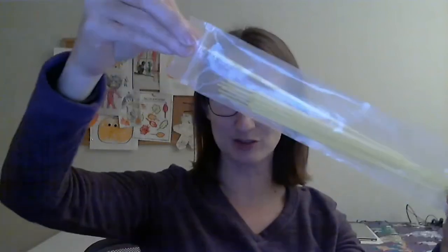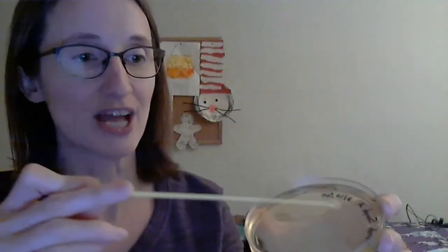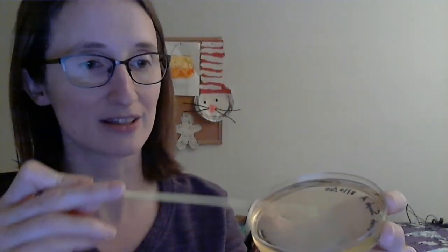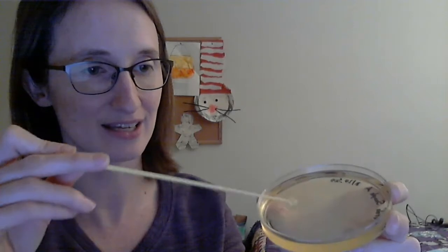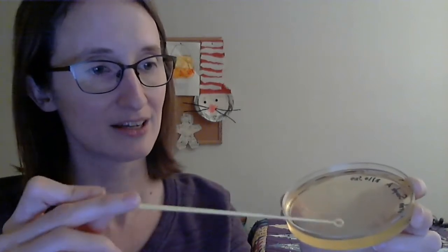Once you add the liquid, the next thing you're going to do is spread it around the plate. I have my bag of loops and I'll carefully reach in the end of the bag and pull out one loop. The key is to make sure I don't touch the loop to anything else — keep it sterile. I'll take the lid off and gently move the loop back and forth on the surface of the plate to spread the liquid around. You don't want to puncture the gel, because then you'll mess it up and have big clumps. The key is to go very gently on the surface to spread your cells around.